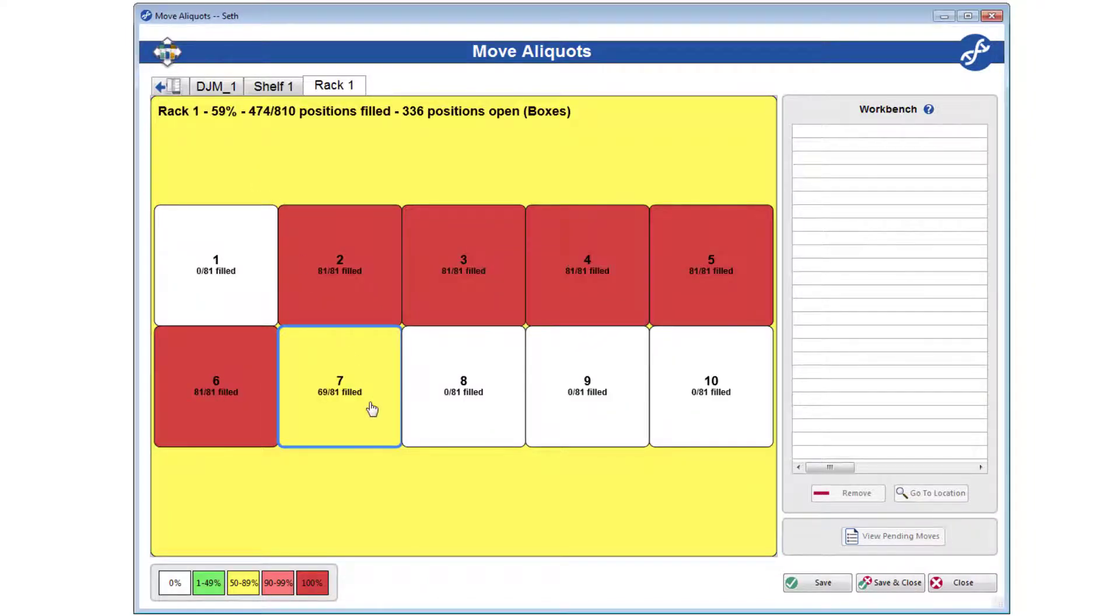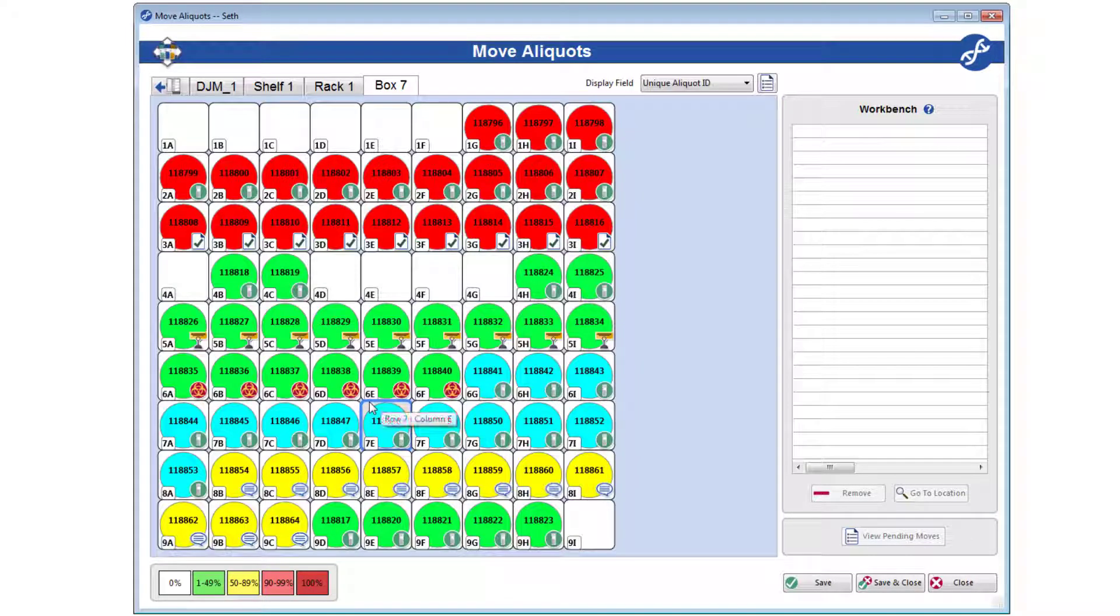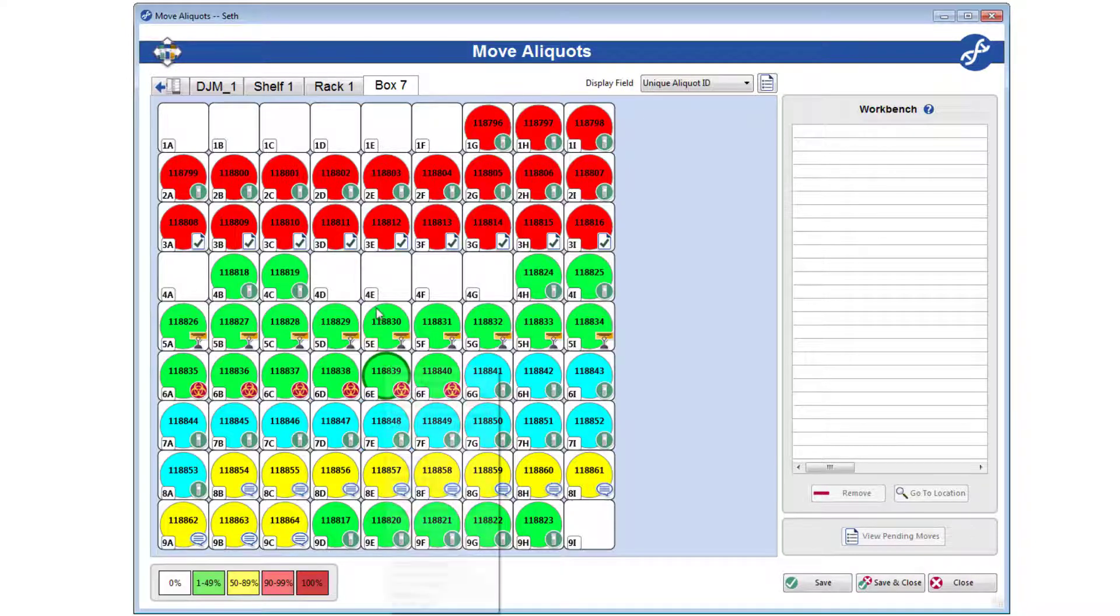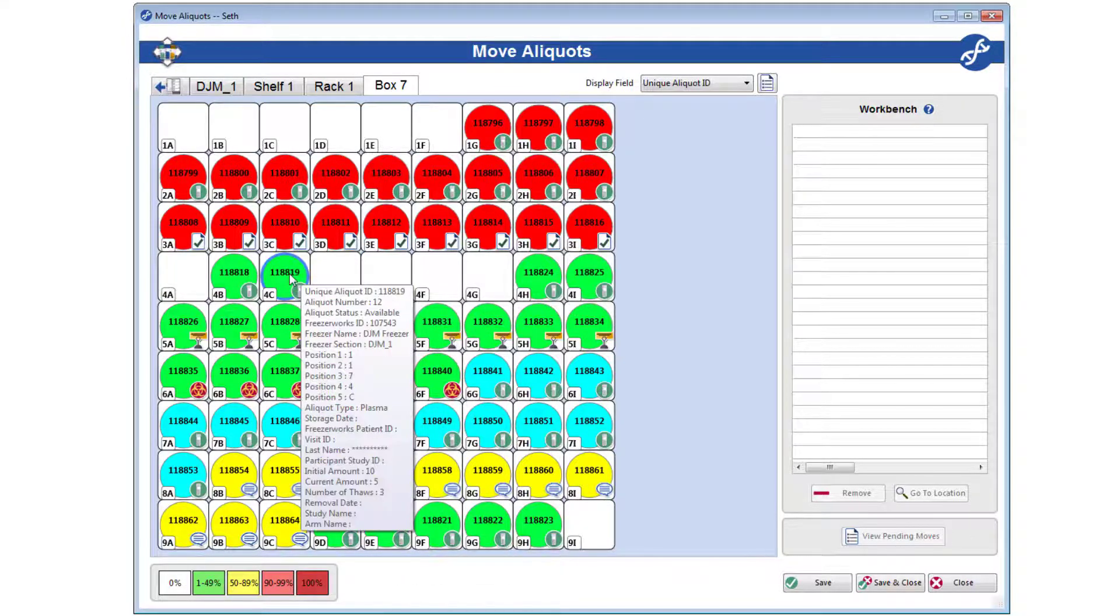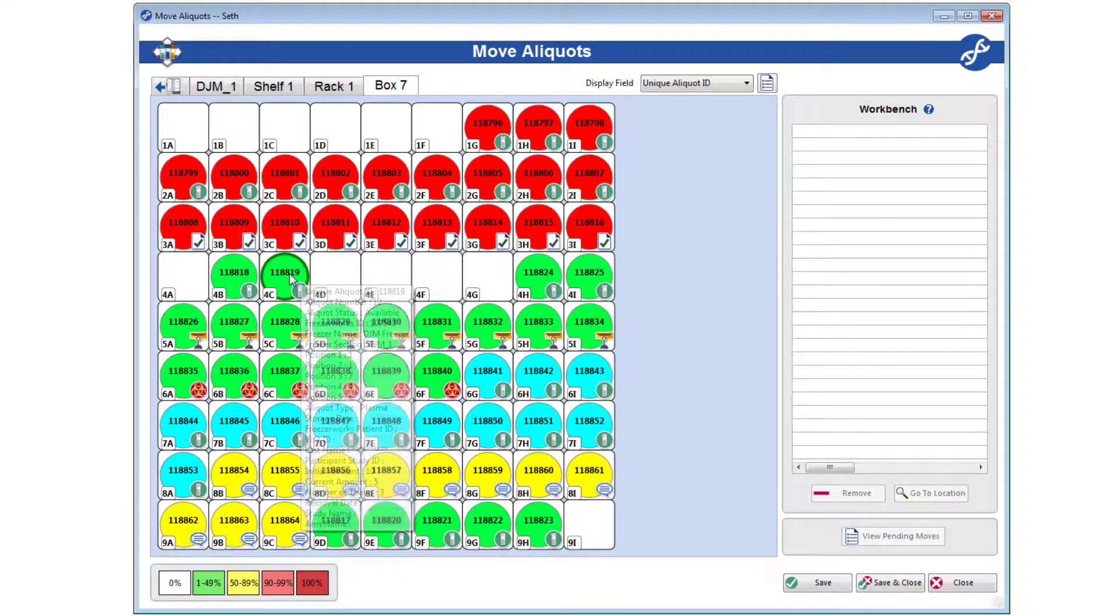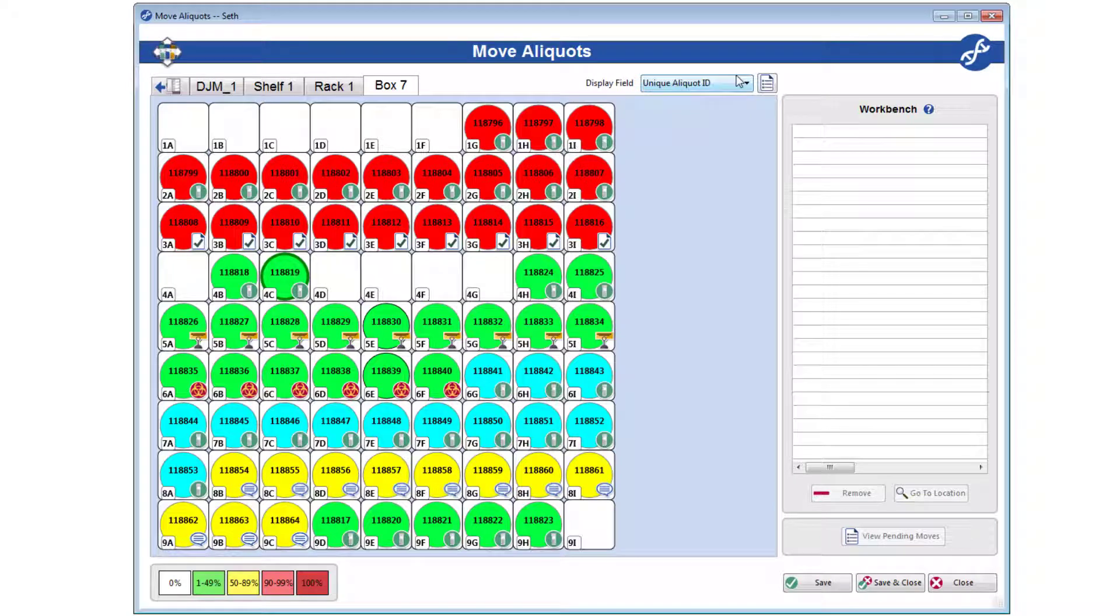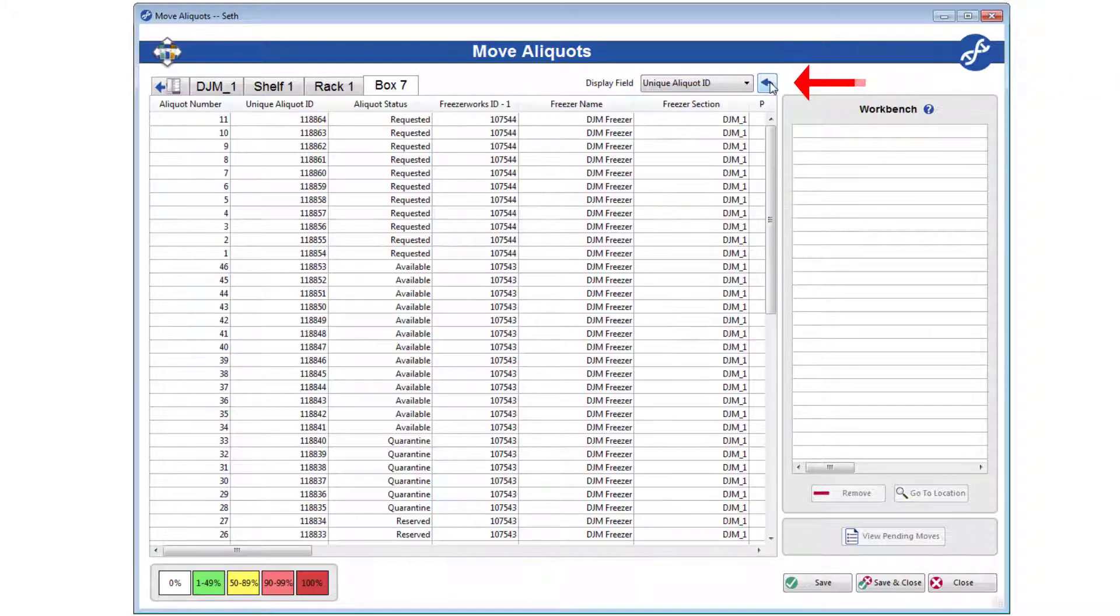Finally, you'll notice there is no right-click menu when viewing a box of aliquots, as Move Aliquots is all about moving. You can, however, change the display field for the aliquots, as well as view them in a list view by clicking this button.